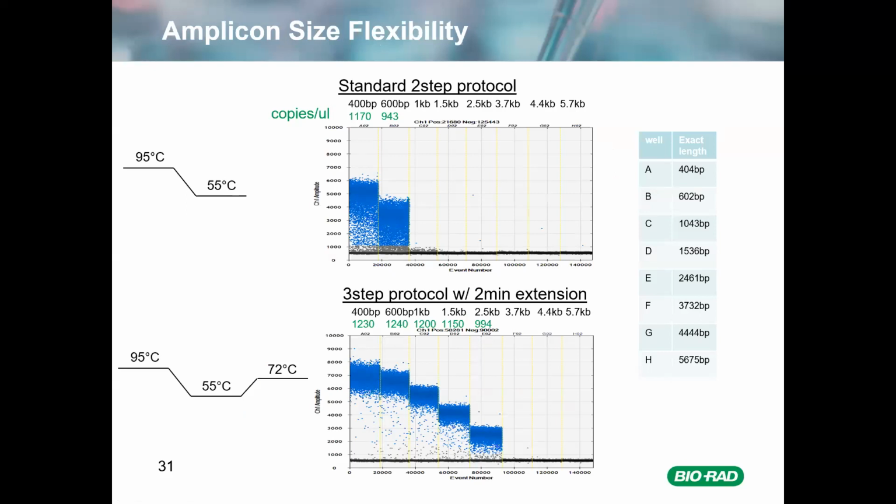The reason for that is that as you start getting past 150 base pairs, the efficiency of your amplification starts to decrease. When I say efficiency, what I'm talking about is that with qPCR, or with any type of PCR, every time you perform an amplification step, you, in theory, double the product. If you exactly double it every single time, that is an efficiency of 100%. If we're not doubling the product, our efficiency goes below 100%. Unfortunately, with qPCR, we are very tied to efficiency.